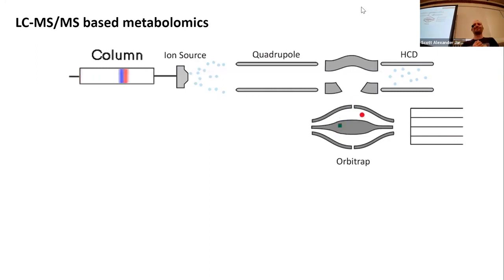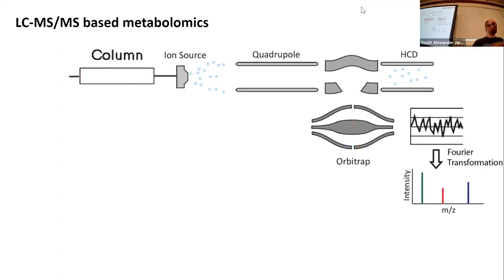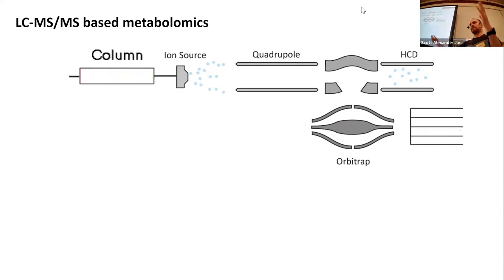All right. So we want to briefly recap what's actually going on right now in this data analysis. We talked on Monday about the general data structure. We have the chromatography as one dimension. Then we isolate ions, fragment them, and generate these MS2 spectra, fingerprints for the molecules.